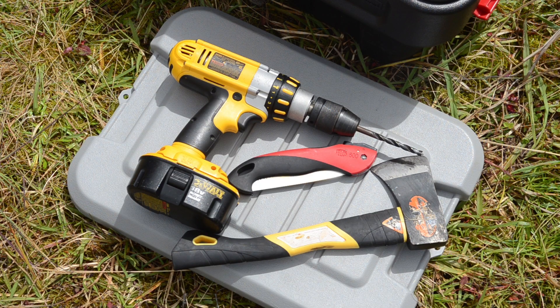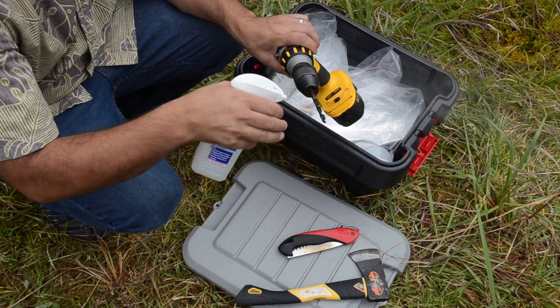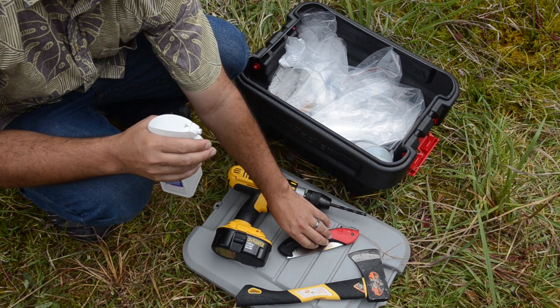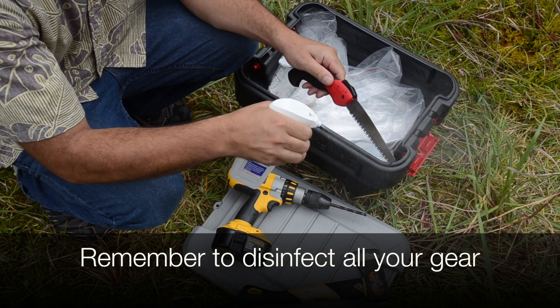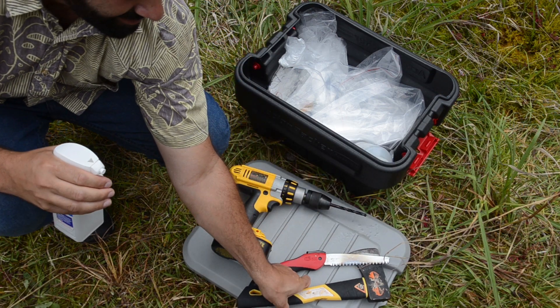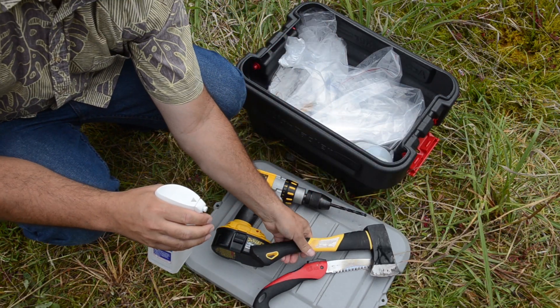There are a few different ways to collect the sample, and there are different tools for each method. Before we get started, we need to spray our tools with 70% rubbing alcohol. This will kill off any spores that were left over from the last sample we collected. We just spray the alcohol on our tools and let it dry, and then we'll be ready to go.